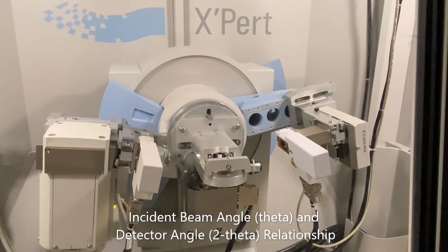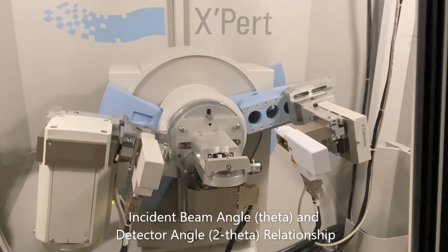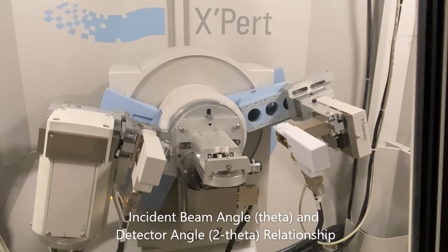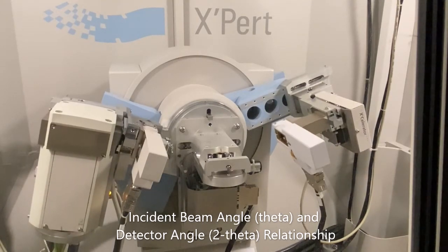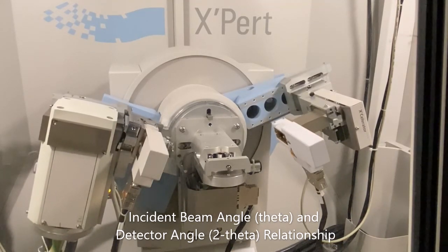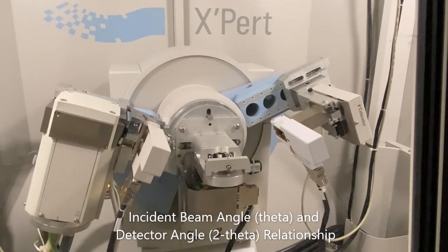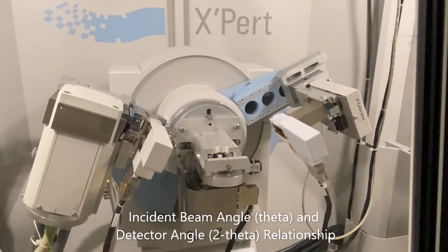The large gray cables are water cooling cables that provide the cooling water to the X-ray target. In front of the X-ray source, the white apparatus with the black cable and gray connector is the device that controls the slit size and the mask size. That's going to limit the X-ray beam size hitting the sample.